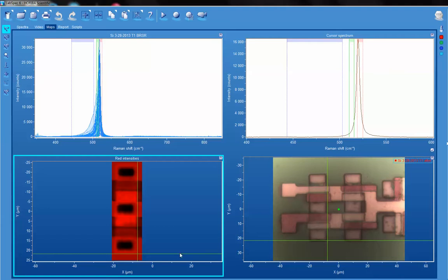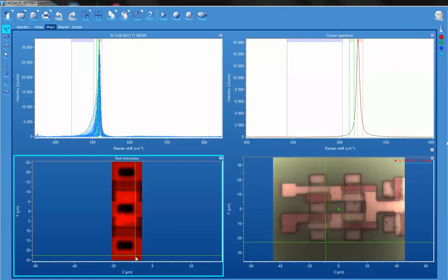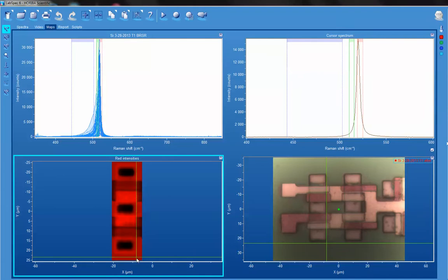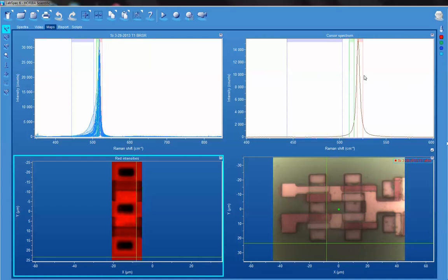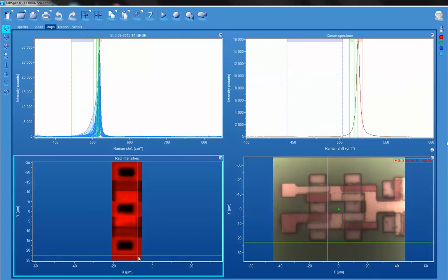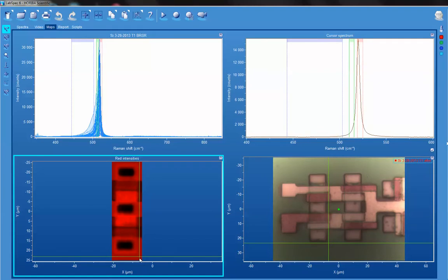Over here is the Raman image that corresponds to the reflected light image. In the upper left-hand corner is the entire hyperspectral data set. In the upper right-hand corner, you'll see the individual spectrum associated with the location of the cursor.